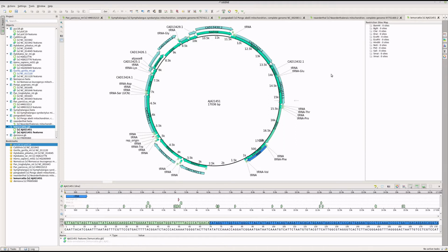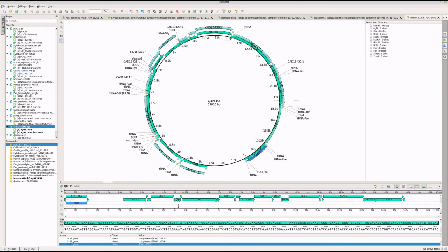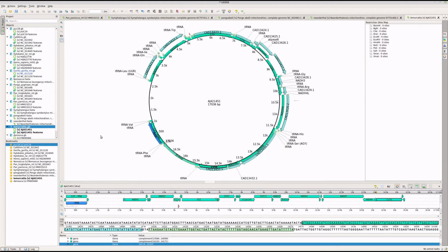Typically, when we do barcoding, we are going to use something like cytochrome oxidase 1, sometimes called COI, sometimes called COX1. Other times, you're going to use something called cytochrome B. Sometimes you'll use a portion of various genes, but that's what we're looking at here. So let's think about doing this alignment, right?